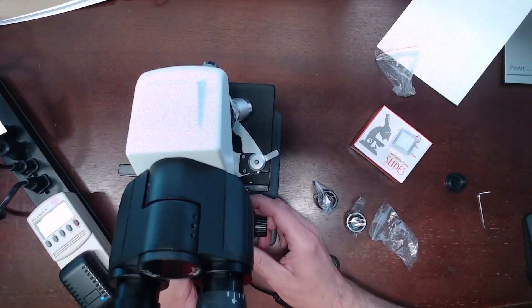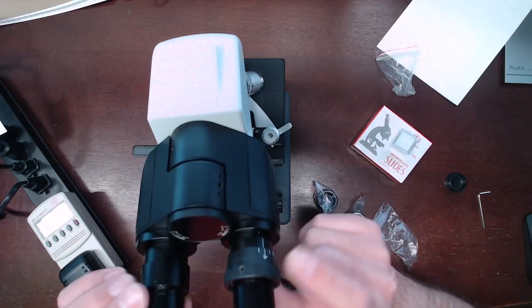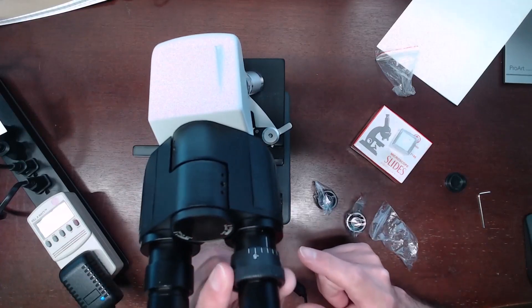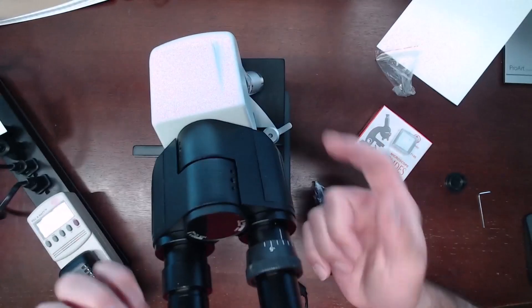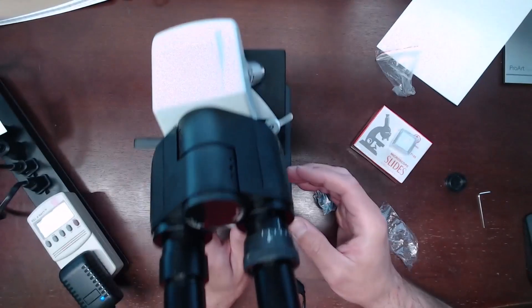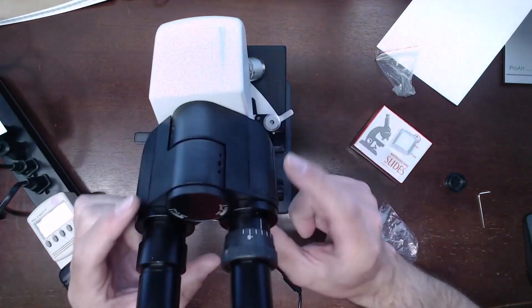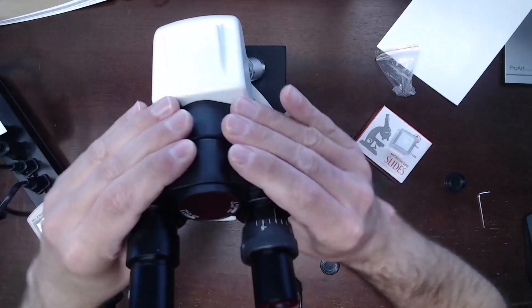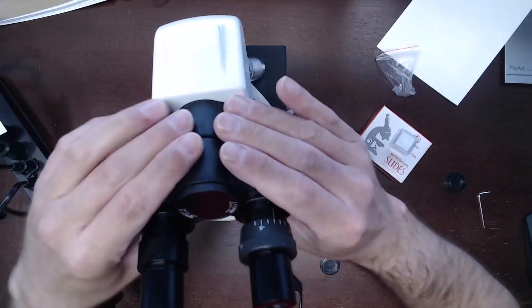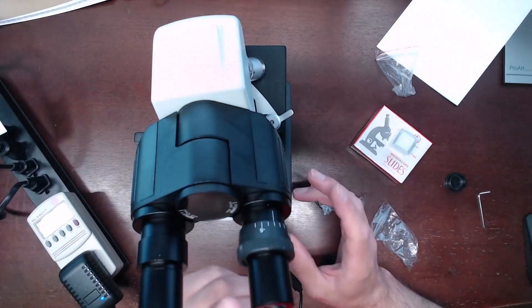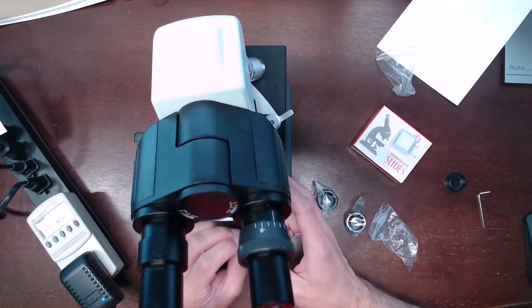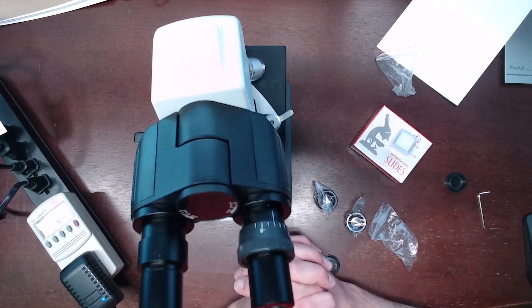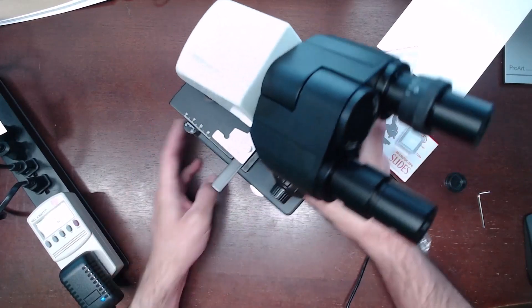This was fairly easy to use. For me the things I noticed is the diopter adjustment is only on the right lens, so you're not going to get the best vision with the binocular. And for me in particular I had some difficulties getting the pupillary distance set correctly. But you can always just use the one side in a binocular fashion and it works fine. It seems like a fairly easy microscope to use.